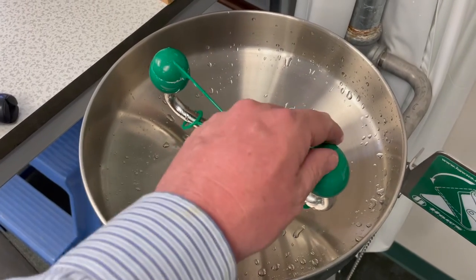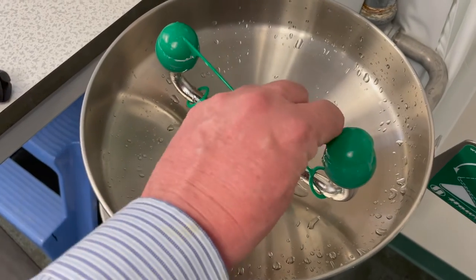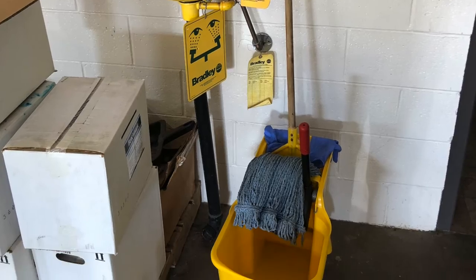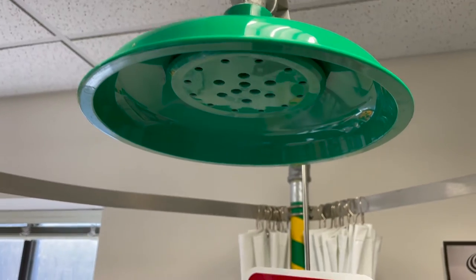Eyewash and shower stations need to be inspected weekly to ensure they function correctly. Inspect the area to ensure nothing is blocking the station. Stations should be easily visible and have a sign identifying them.